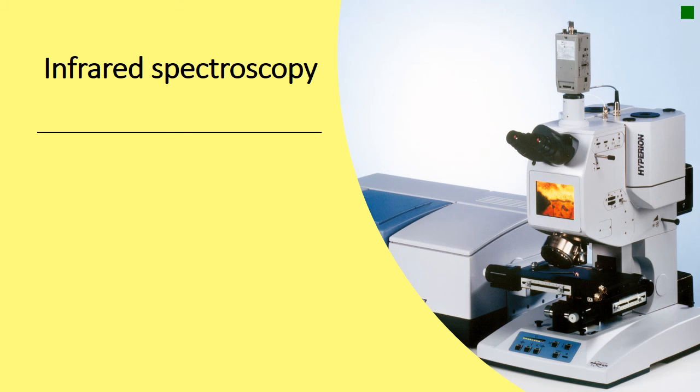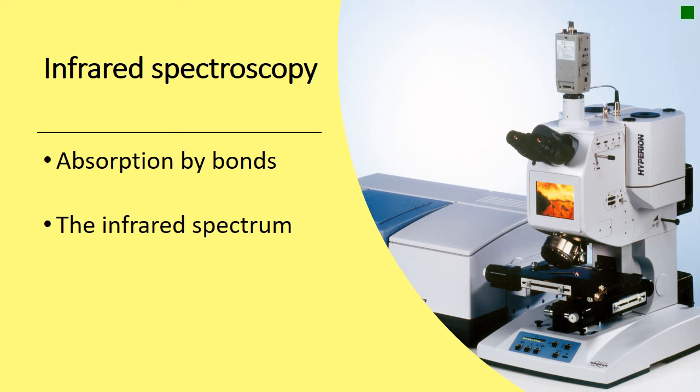So that's about it for this lesson. Let's just make sure we did all we wanted to do. We wanted to have a look at how infrared is absorbed by bonds, and we looked at the little diagram of rotating and vibrating bonds, and then how the machine shines broad spectrum radiation at a sample. Some of the wave numbers are absorbed, and from that we get the spectrum.